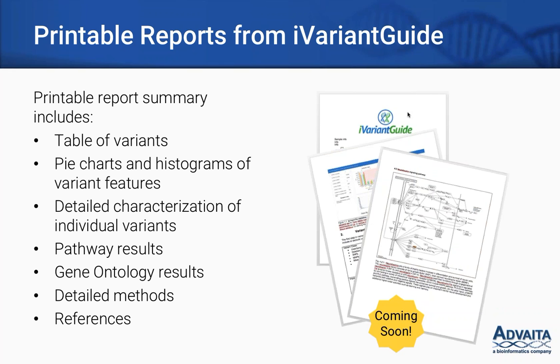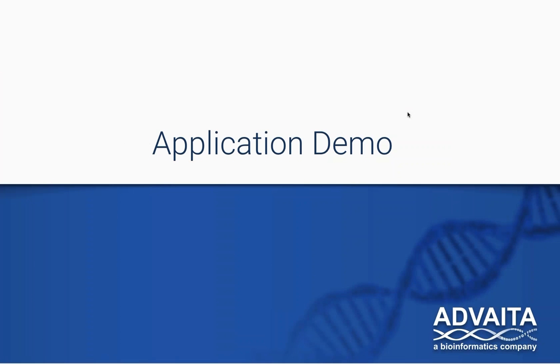In the upcoming release, we will offer a comprehensive printable report that may be used to publish your analysis results in a manuscript. This will include all of the analysis available in iVariantGuide, a full table of variants in your filtered set, graphs of how the features break out across your set, variant details, as well as pathways and gene ontology terms analysis, detailed methods, and references. Now let's take a closer look at iVariantGuide.